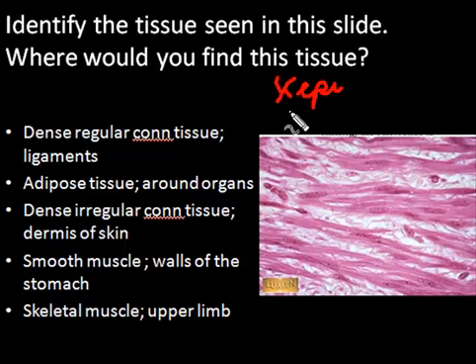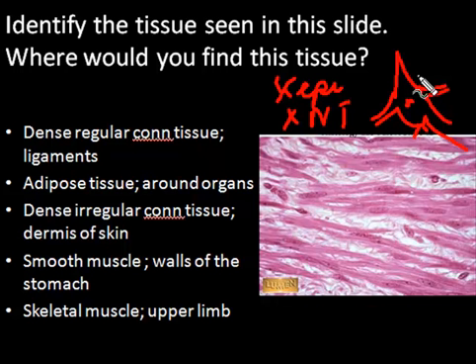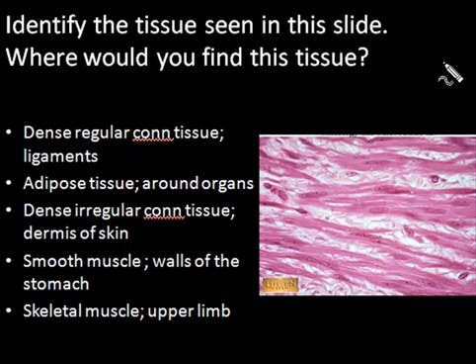It is also not nervous tissue, because in nervous tissue you'll see multipolar cells like this, which have processes, and you'll see axons, so there'll be many of these, plus the nuclei of neuroglia, so that looks very different. So it's not that. So the only possible choices you have is it is either connective tissue, any form of connective tissue, or it is muscle tissue.